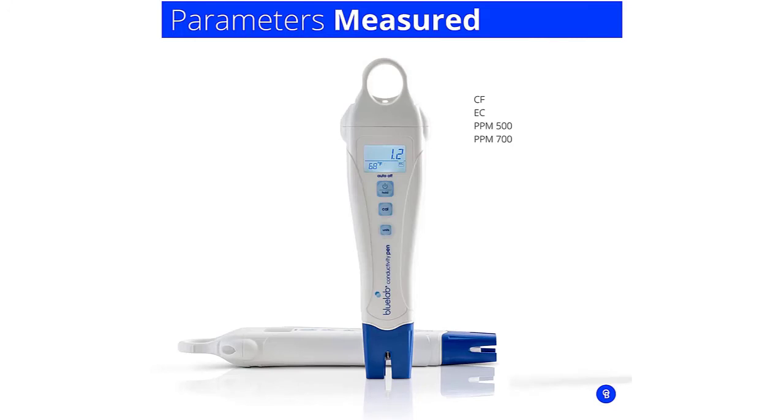TDS equals Total Dissolved Solids, which are the inorganic salts and organic matter in a liquid. The lower the TDS level, the purer the water is. Conversely, higher TDS levels indicate more particles dissolved in the liquid.